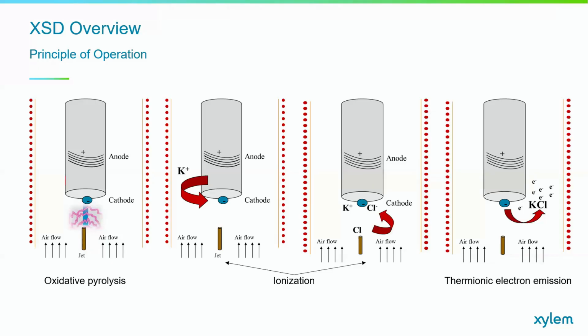Okay. Ionization is the process where a neutral atom or molecule gains or loses electrons, resulting in a charged particle called an ion. So a common ionic reaction is table salt. The ionic compound is formed, sodium chloride. Sodium loses an electron, becomes positive sodium ion. Chlorine gains an electron, becomes a negative chlorine ion. They form table salt. Ionization is actually the reason why radiation like X-rays or gamma rays are so dangerous. These waves are so powerful that they carry enough energy to knock electrons out of atoms or molecules, causing them to ionize. This disrupts the structure and function of molecules like DNA.